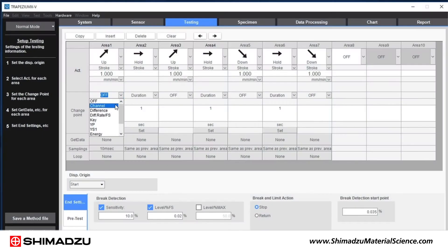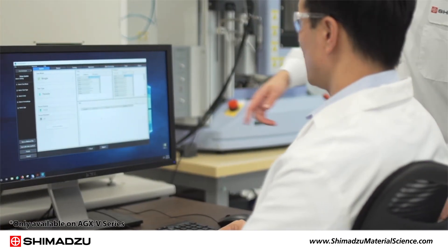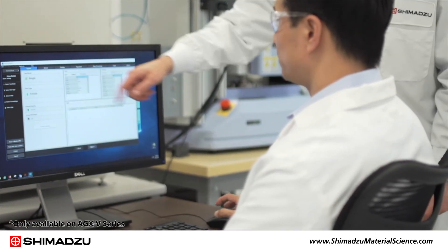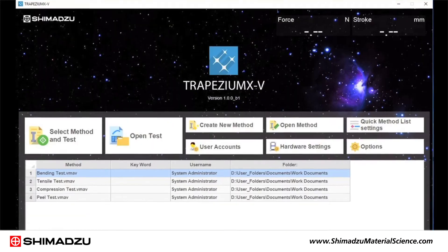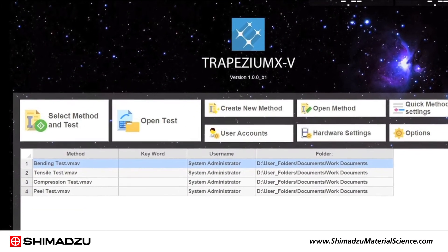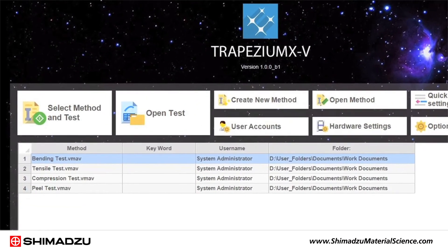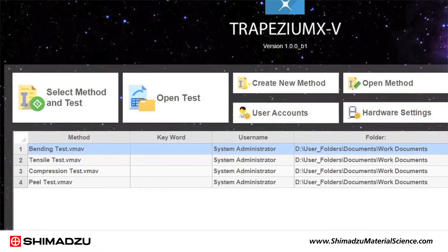Running tests with Trapezium XV is driven by easy-to-use wizards that prompt the user for all the information necessary to create test methods. You can save your methods and access them when you need them from the quick method drop-down list.